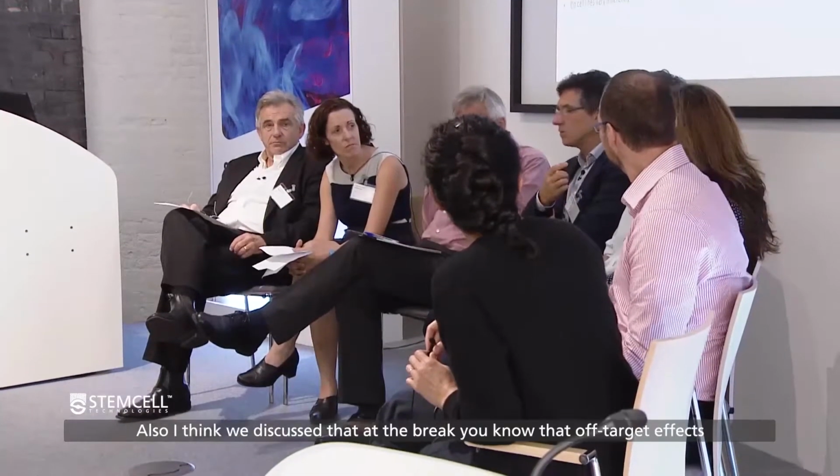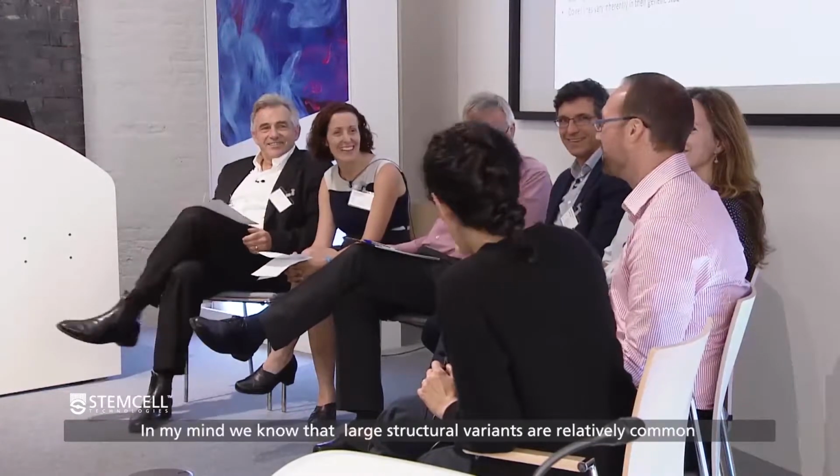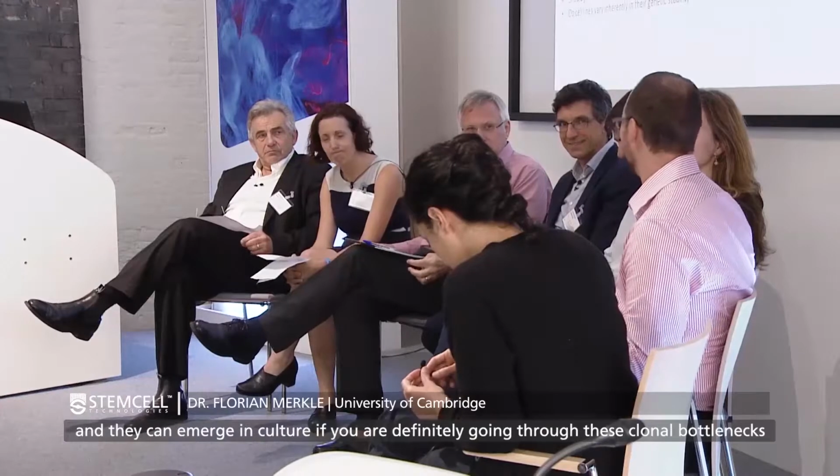Yeah. No, also, I think we discussed during the breaks that off-target effect is a problem, but is it the biggest problem? So in my mind, we know that large structural variants are relatively common, and they can emerge in culture.